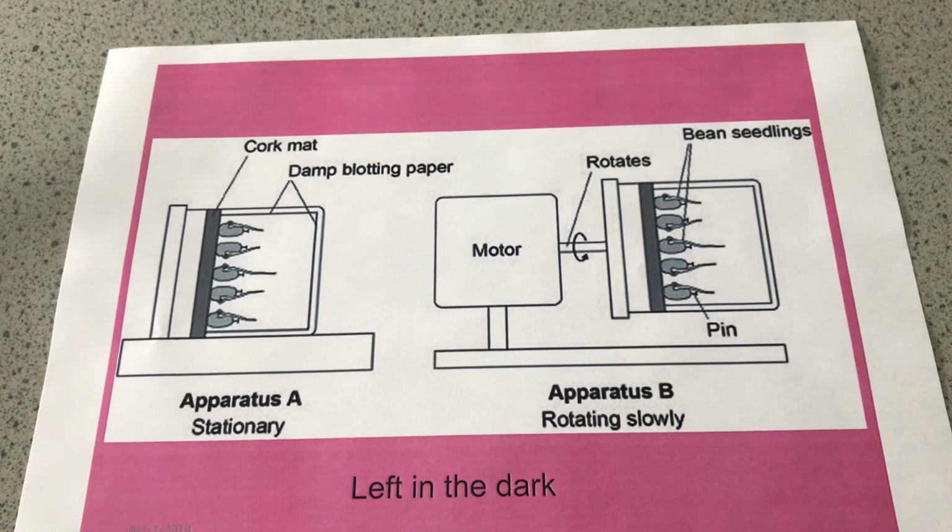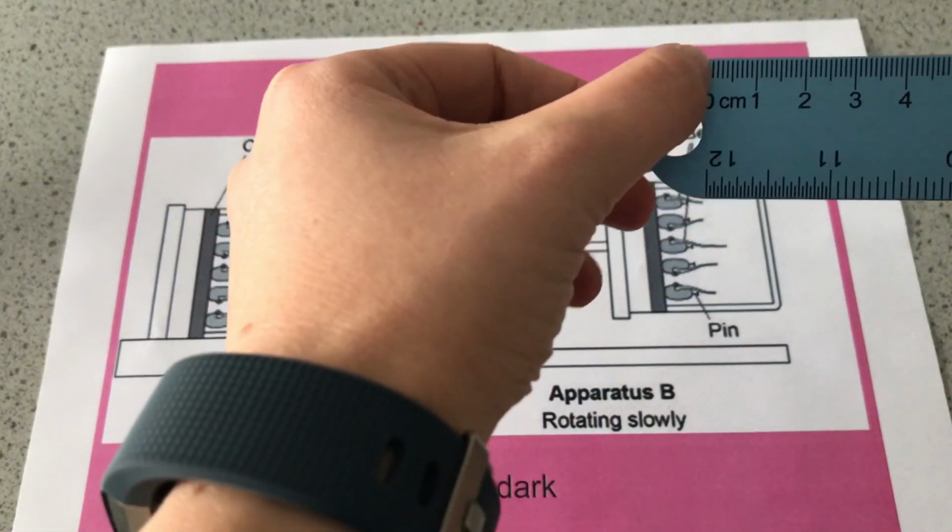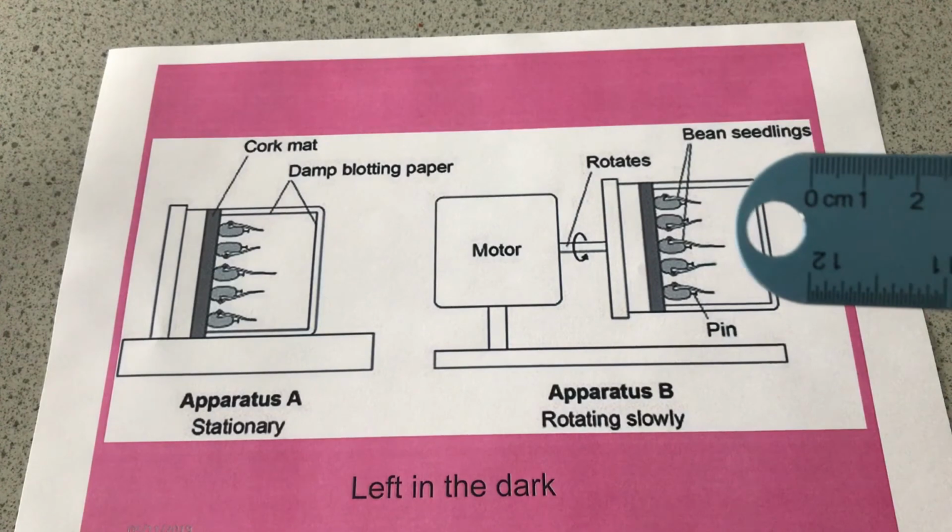Now, if we're doing the same way of measuring and we're doing start and end, we would eliminate it anyway. But if we're just looking at getting an accurate measurement of the height, then we've got to use the ruler in an accurate manner, okay? And having a ruler that starts with the edge of the material of the ruler on 0 is going to enable us to be more accurate in our readings.